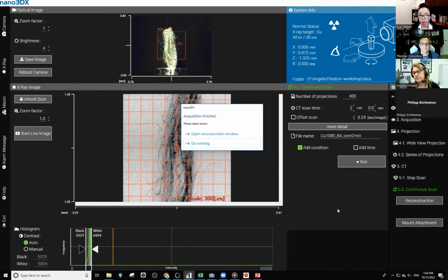Yeah, well, depending on your sample, if you're looking at living things or no longer living, but dead, say bugs and things like that, you can use stains to enhance contrast. So that's one thing you can do. You can use things like phase contrast, and there are some reconstruction tools and hardware that accomplishes that for you.